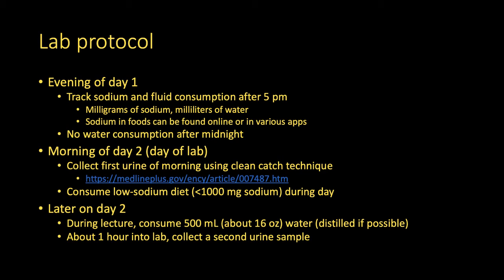This lab protocol actually starts the night before your lab. On the evening of the night before your lab, you, the subject, will need to track your sodium and fluid consumption after 5 p.m. For everything you eat or drink, you need to keep track of how many milligrams of sodium that contains and also how many milliliters of water you drink. To know the amount of sodium in your foods, you can look up foods in all sorts of online resources. There are even several apps for iPhone and Android phones that you can use for reference.